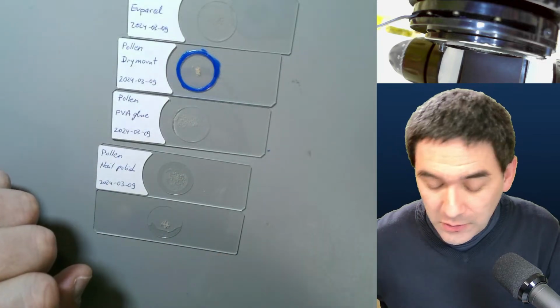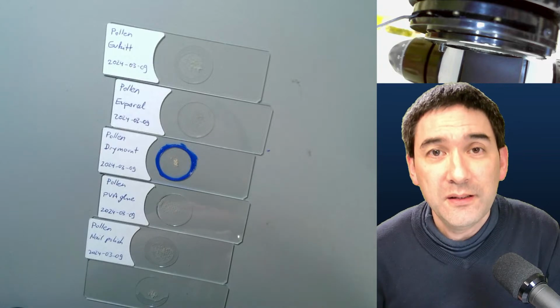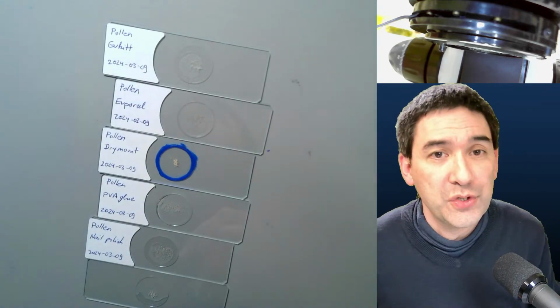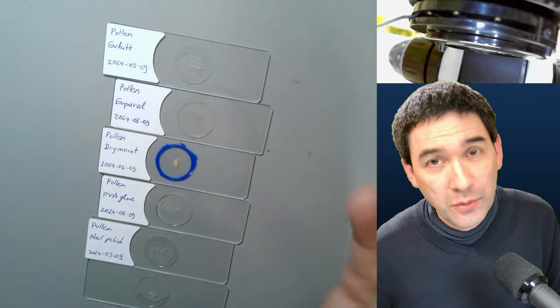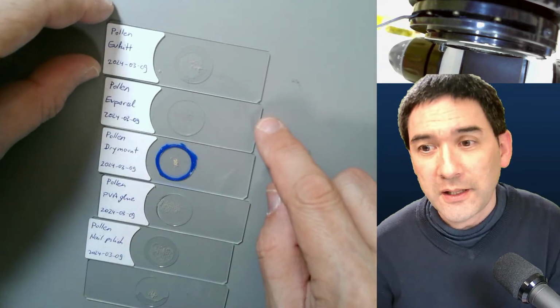And now let's have a look if, based on the mounting medium present, there is a difference in image quality, and then also, of course, using the dark field and whatever. Okay, I just need to forewarn you, the difference is not going to be too big. However, there are a couple of other things that I would like to mention here.